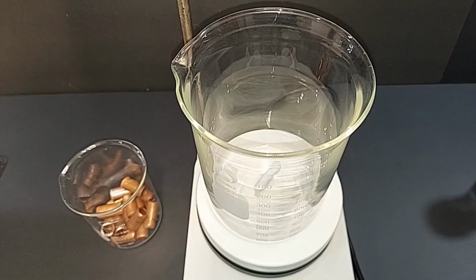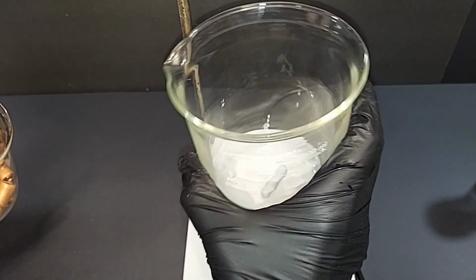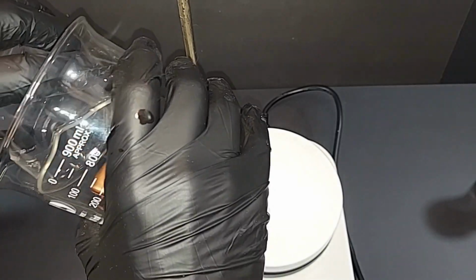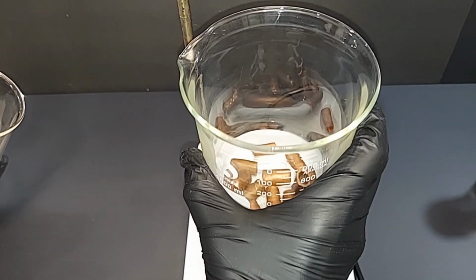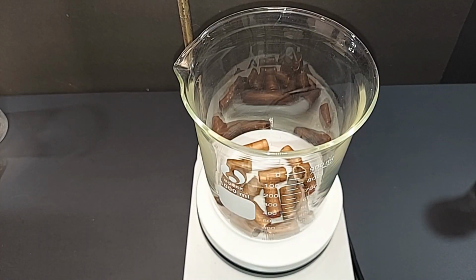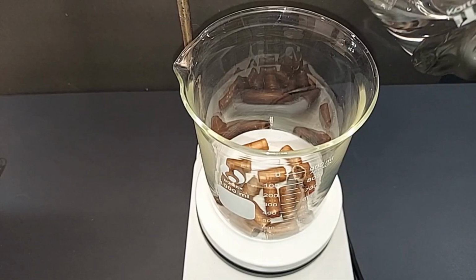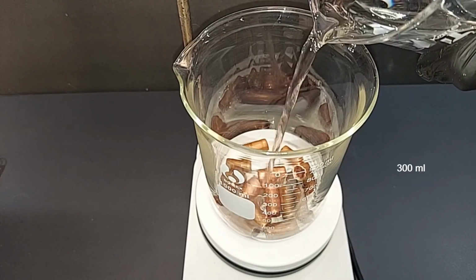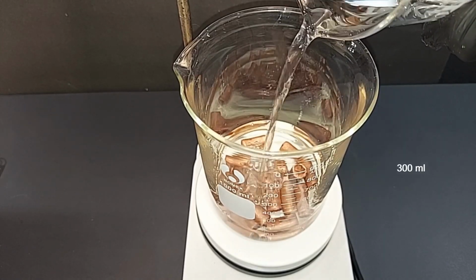First thing I'm going to do is add the 100 grams of copper here to this 1-liter beaker. I did put a magnetic stir bar in there. I'm not sure how effective that's going to be or not, but I figured I'd put it in first before we start anything. Next simple step, adding the hydrochloric acid. Again, this is 31%. Copper, of course, will not dissolve in this at all. It would literally take weeks at a pretty high temperature for that to happen.